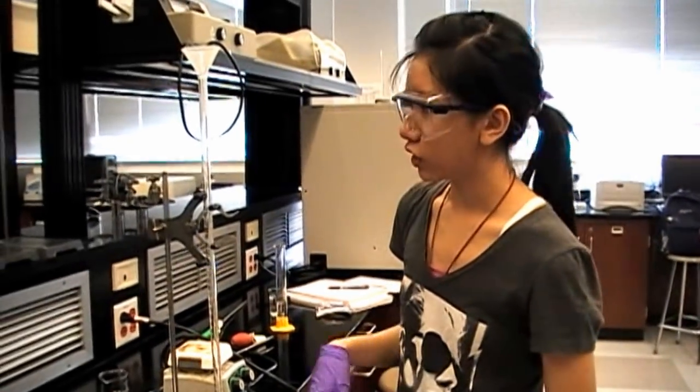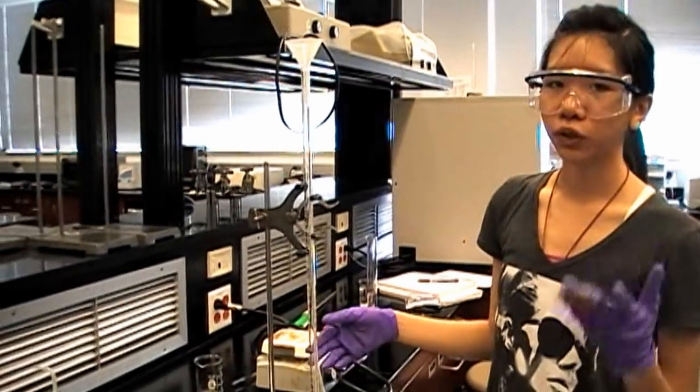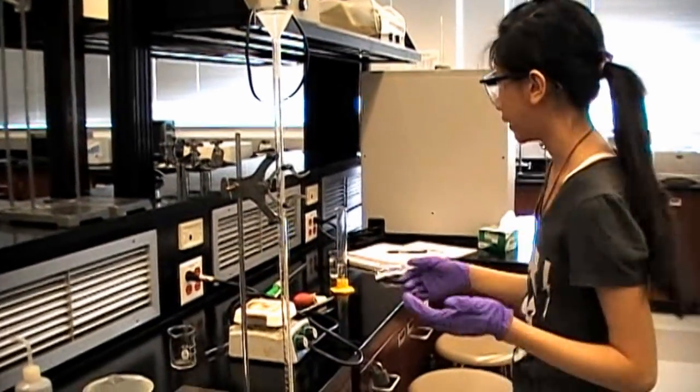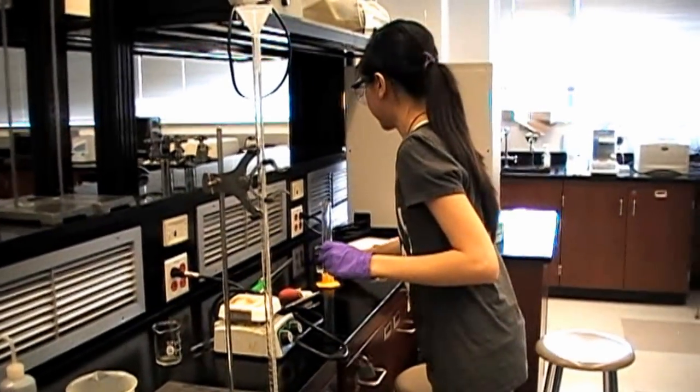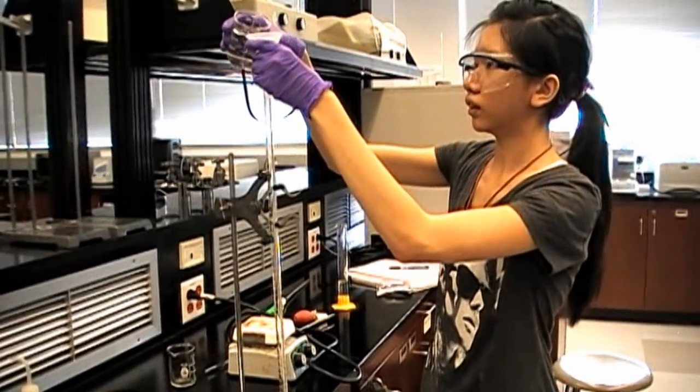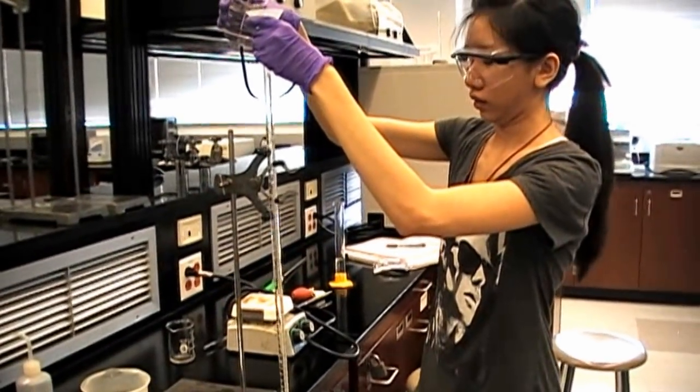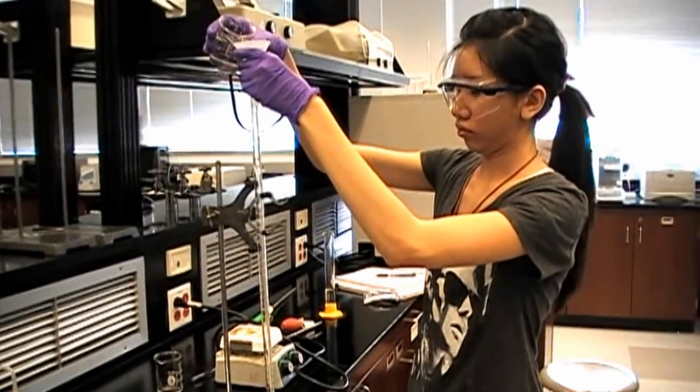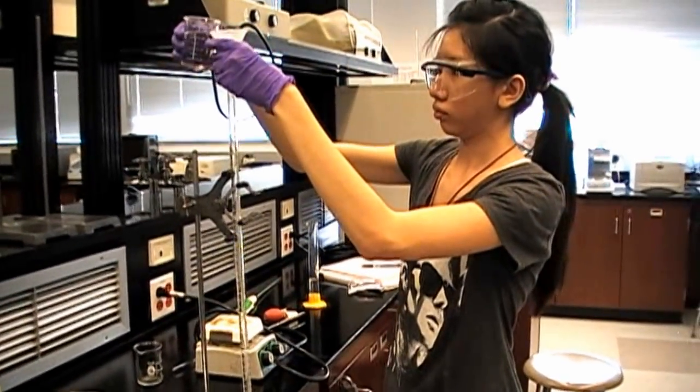First, you have to prime your burette with your sodium hydroxide. Priming your burette is essential because you want to make sure you're titrating with the same concentration of your solution. Your titrant is the NaOH in the burette.